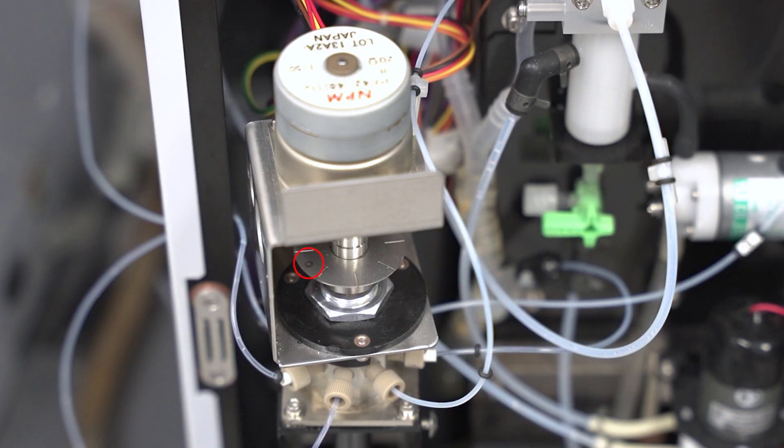First, locate the circle engraved on the silver interrupt plate and make note of which port on the valve it is lined up with. This indicates the port the valve is open to, which is important for ensuring the new rotor will be inserted with the correct orientation.